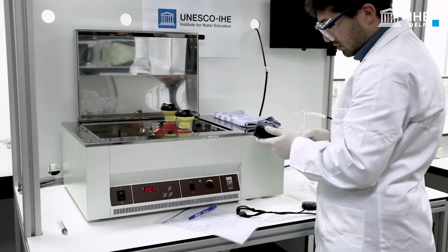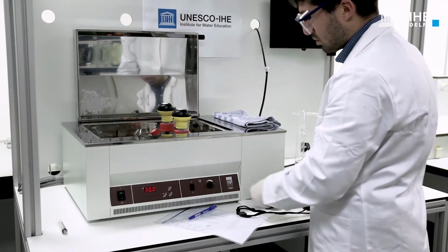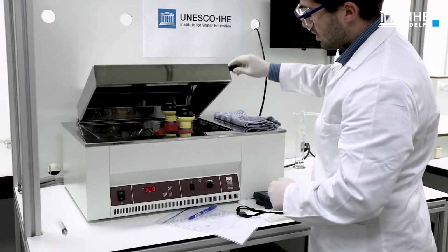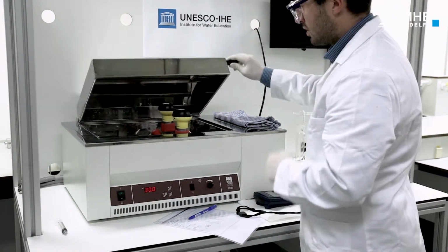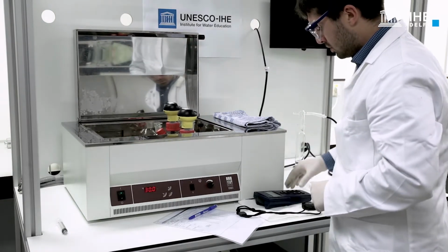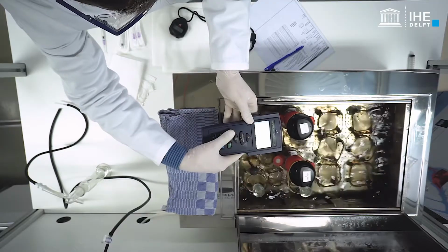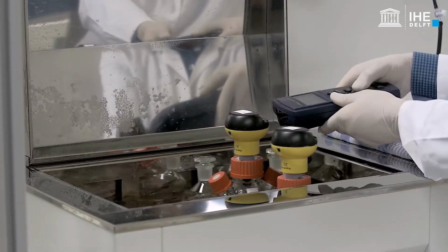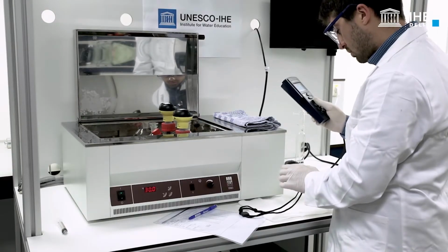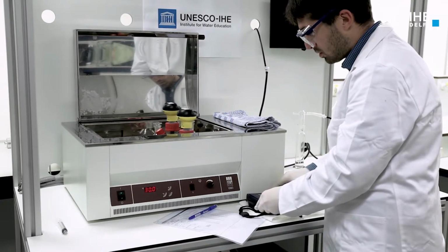Instead, it will keep on rising due to nitrate reduction by heterotrophic denitrification. Wait until the slope of the pressure curve becomes stable, meaning that the endogenous denitrification rate is constant. The nitrogen gas production rate of the endogenous processes will be constant throughout the test. To obtain the net maximum Anammox reaction kinetics, the nitrogen gas production rate of the endogenous processes will be subtracted from the nitrogen gas production rate observed after the addition of substrates.